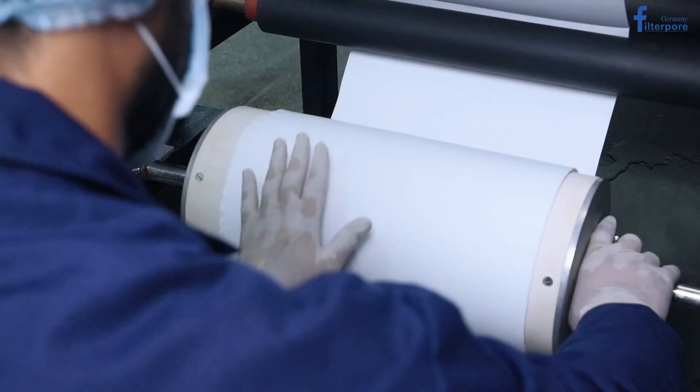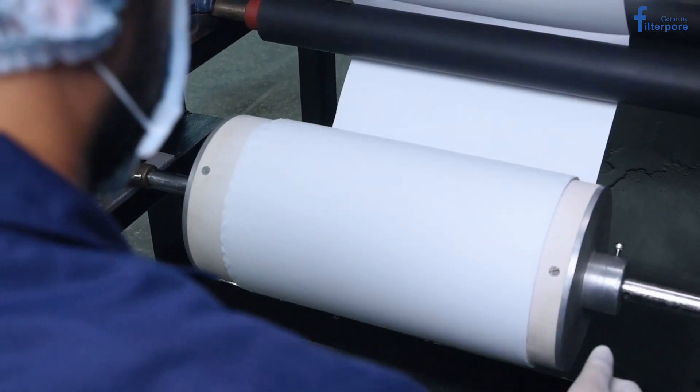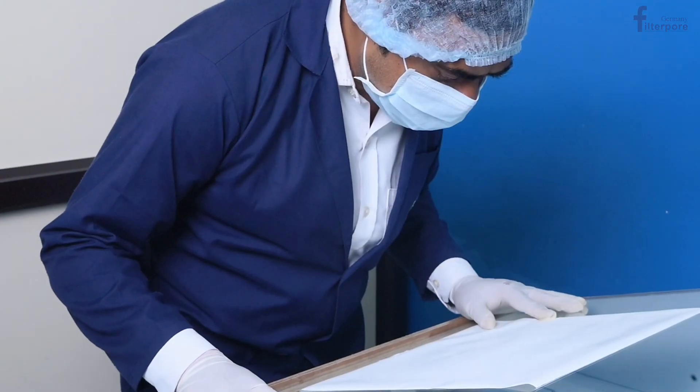Scientists use syringe filters to prepare samples for analysis, ensuring that particulates don't interfere with results.